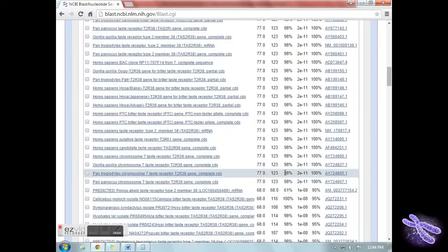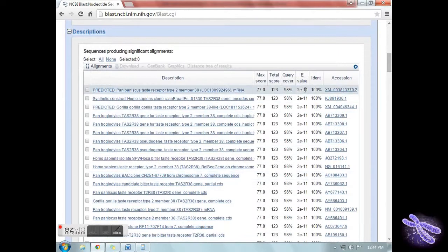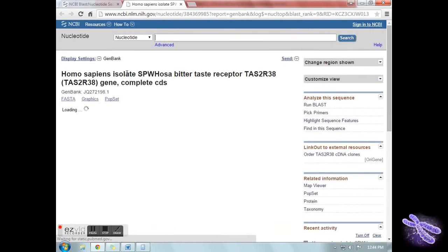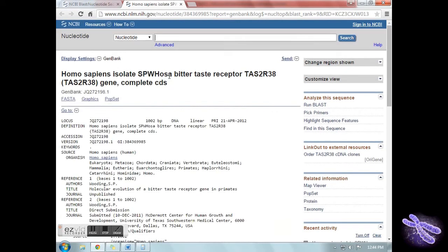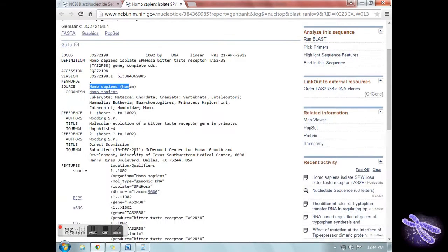Click on the accession link of the hit containing the human taster allele with the lowest E value. Notice that you'll find its base pair length, its accession, the source, as well as the references.